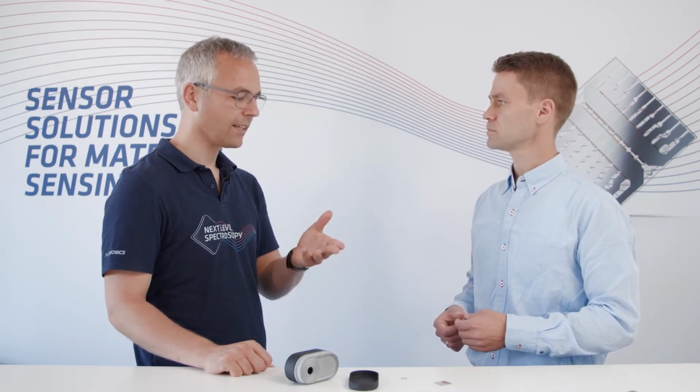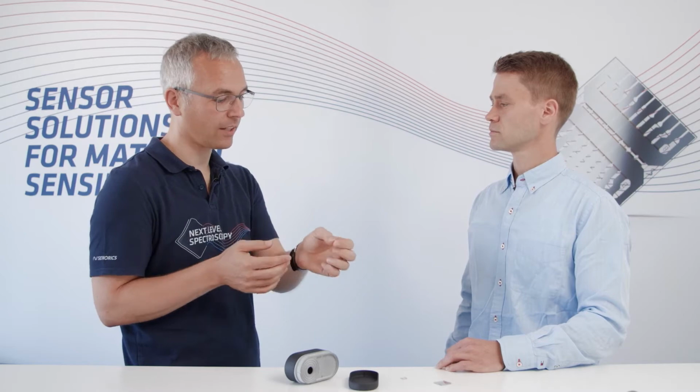So basically, when classic spectrometers use silicon or indium gallium arsenide, they cover all wavelengths at once and they need to split it up, while we have individual pixels that can only detect one wavelength, and we can even tailor this to the wavelengths of the application. Yeah, exactly.